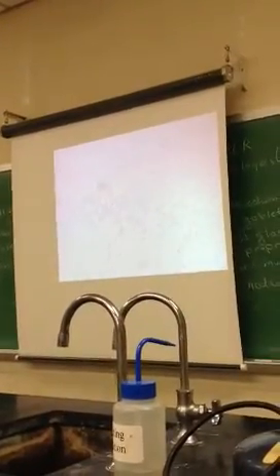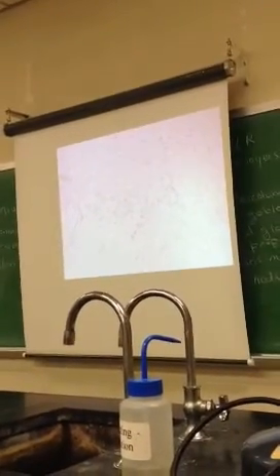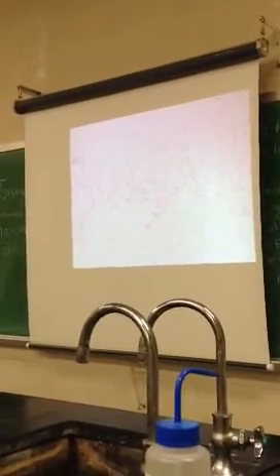So we'll see if we can move up and see if there's an actual good delineation between the two. There it is. See it? Right there. You see that? See how it's kind of a smear effect almost on the top half here? And then we get kind of a more curved pattern there. I see the same curved pattern. But I see some swirling right here.